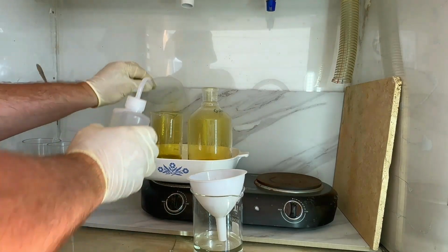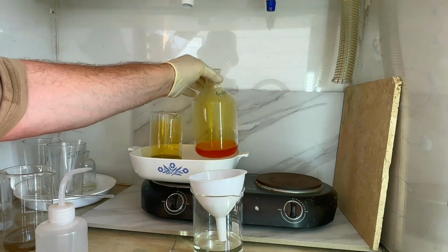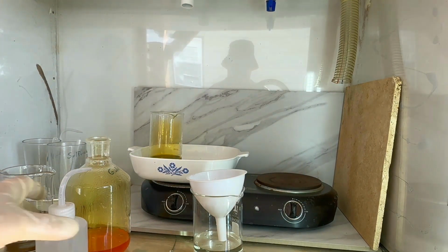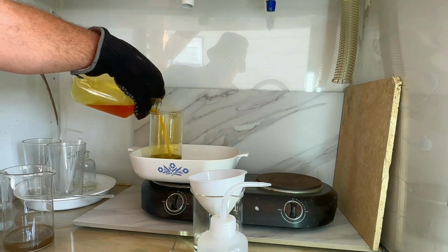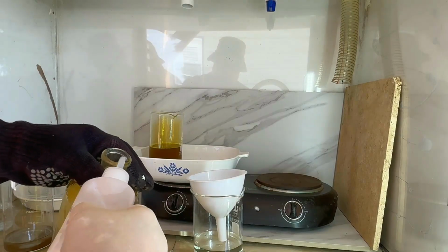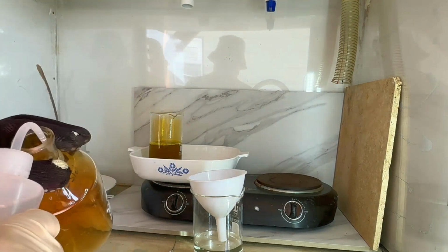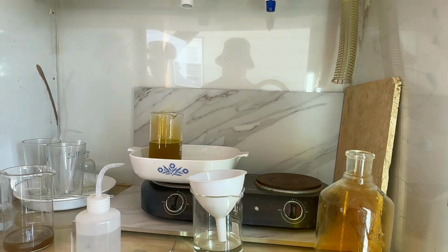All right, so the next thing I'm going to do, I'm going to go ahead and combine these two solutions into the one beaker. I'll just simplify the process going forward. All right, that gives me my empty temporary stock pot to use a little later.